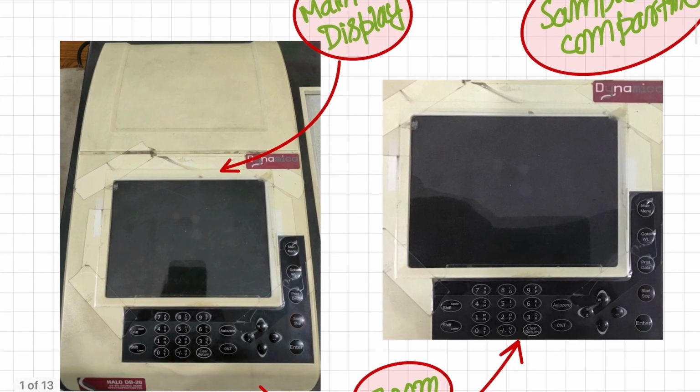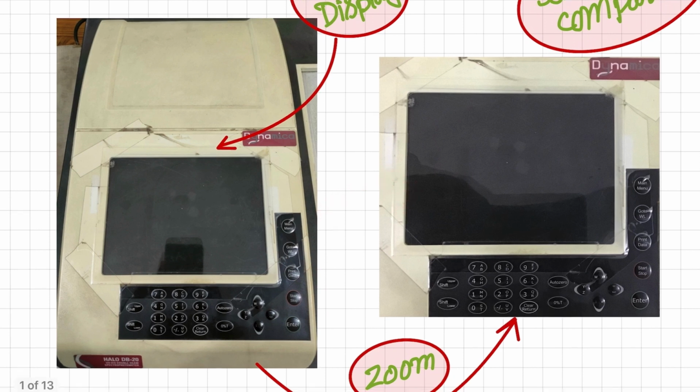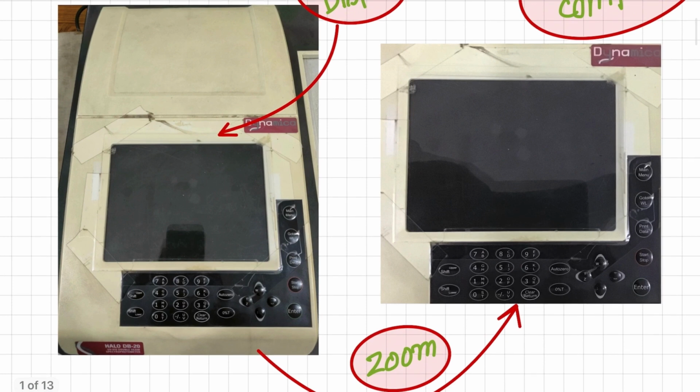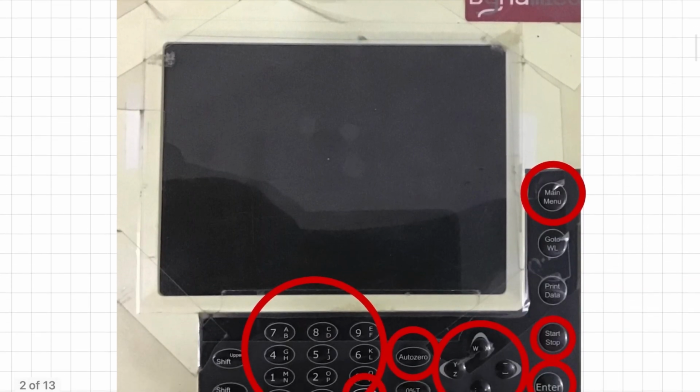If we see from the top, this is the main screen and these are all the buttons from which we operate the instrument, and similarly this screen has been explained here with zoom, and this is the Dynamica model which we are currently using.